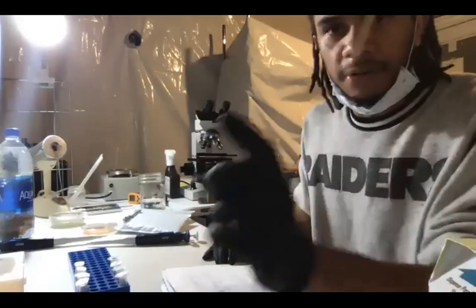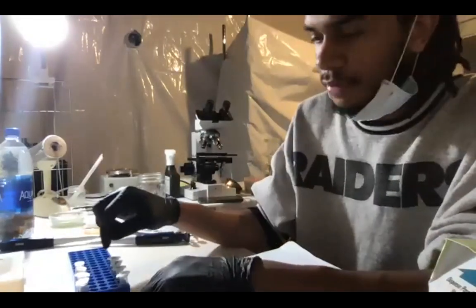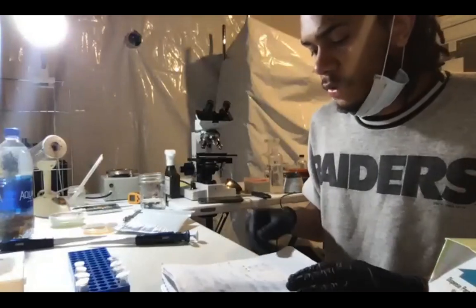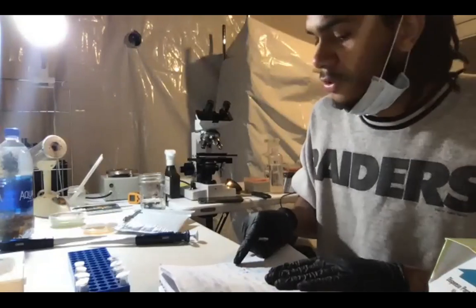Actually, I'm doing the math wrong, so my apologies if anybody started writing that down. I'm going to be doing 8 samples because I have to do 2 for each of these. So 8 samples at a 25 microliter reaction is 200. The total reaction volume is going to be 200 microliters, divided by 2. That'll tell you how much master mix you need to use.